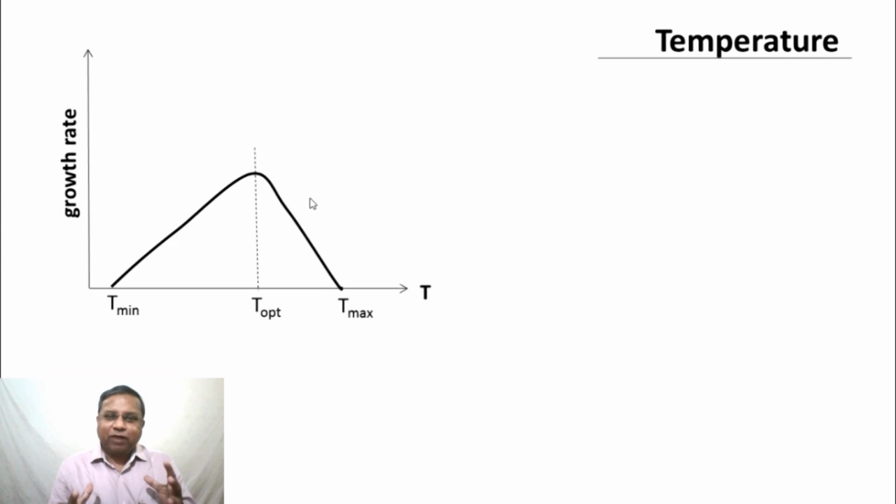We already have a large number of cells, or a larger number of cells compared to other temperatures, and the total production is the amount produced by each cell times the total number of cells. So we have maximized the total number of cells in a particular volume. In other words, we have maximized the concentration of cells, and then by increasing the temperature, we are making each cell produce at a higher rate. Therefore, the overall productivity from the bioreactor will go up.